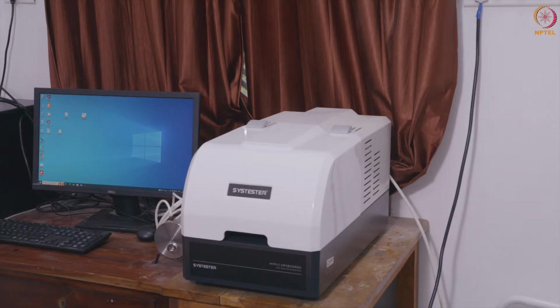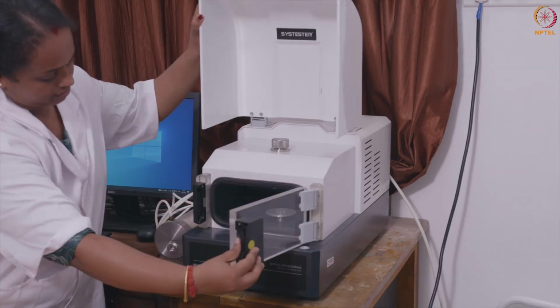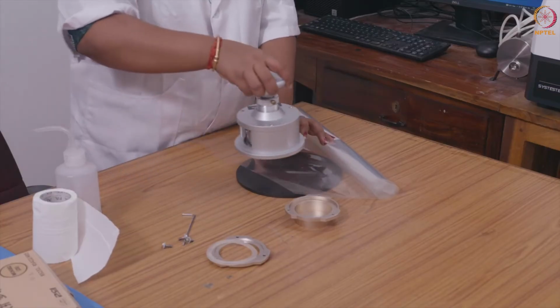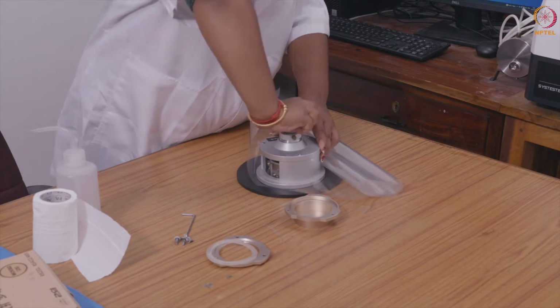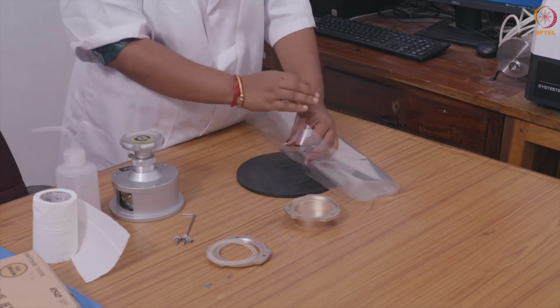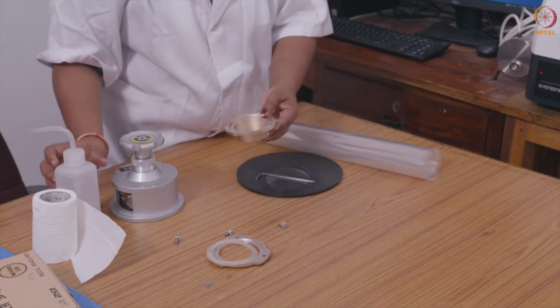The water vapor transmission rate can also be measured using a water vapor permeability tester. This is based on the humidity sensor detection method and on the weight measurement or the gravimetric method, which measures the gain or the loss in moisture. Here the conditioned sample is first cut. In the software assisted method, the cup is filled with water and then sealed well with the test packaging material.